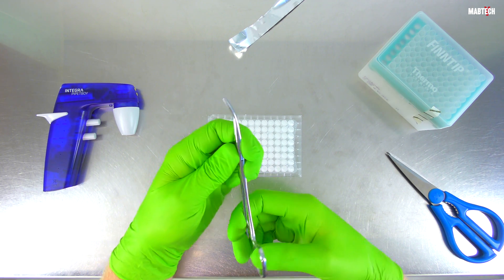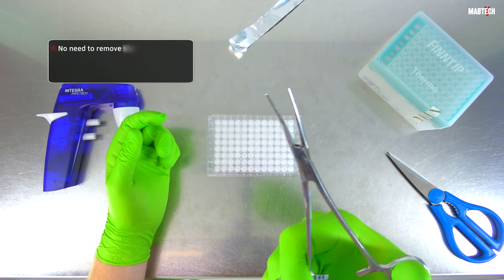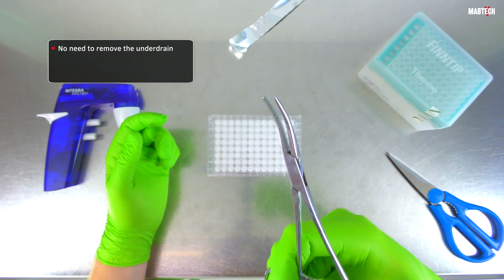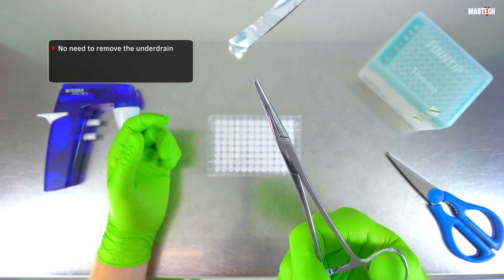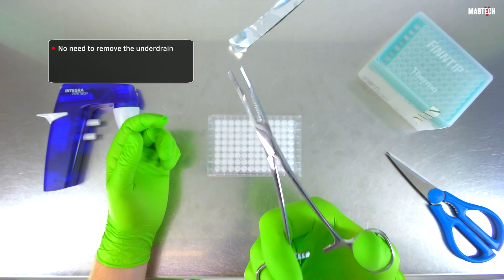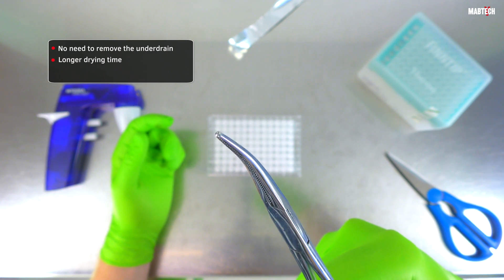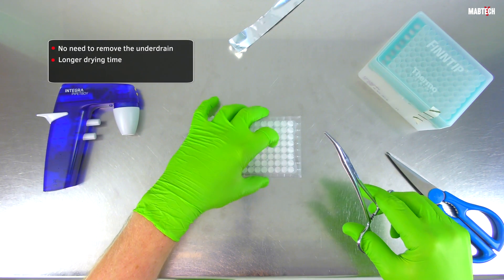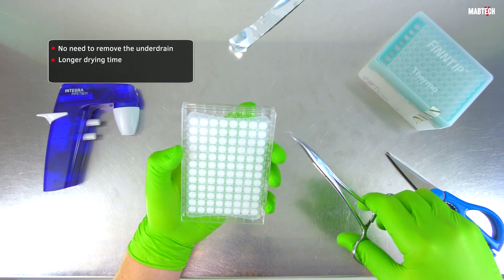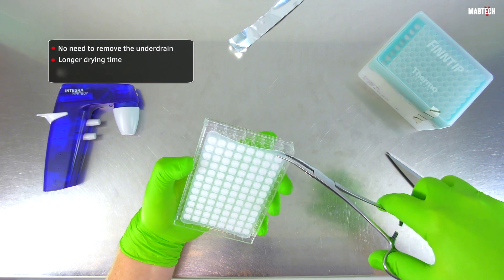Finally, in our MabTech protocol, we do not explicitly state that the underdrain must be removed following spot development. In fact, in my experience, the only downside to keeping the underdrain in place is that it will take longer for the plate to dry. Nevertheless, many users desire faster drying time and will attempt to remove the underdrain.